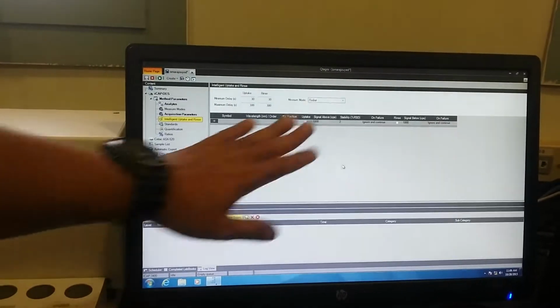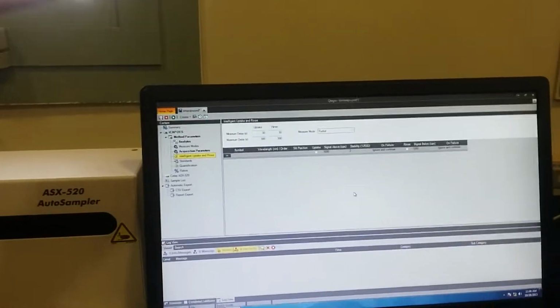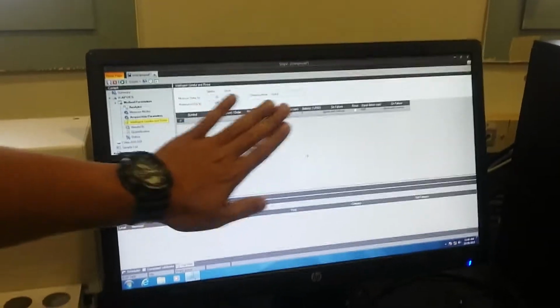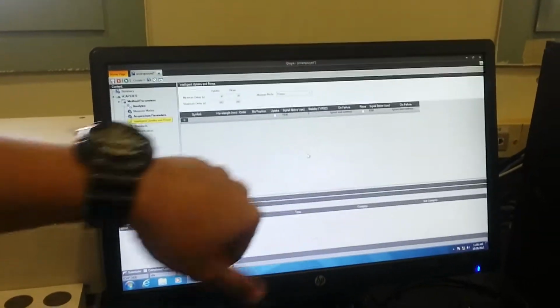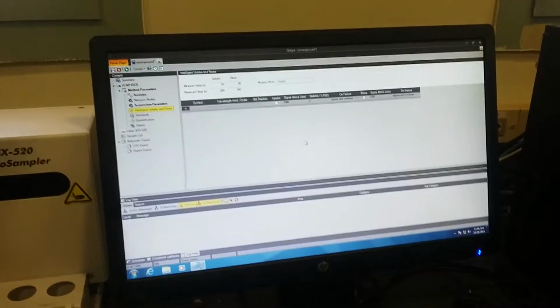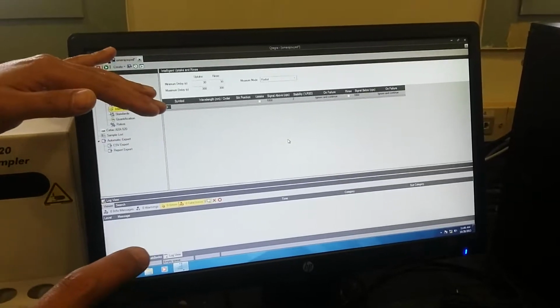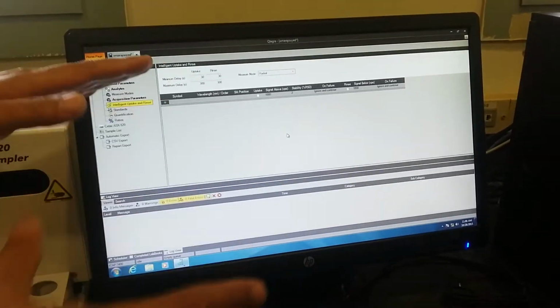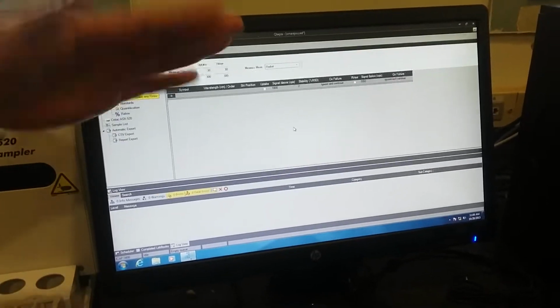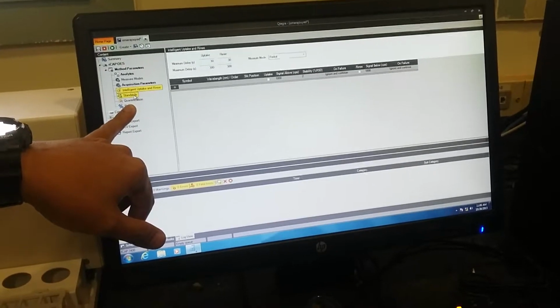But usually we don't need it. This is only when you are doing R&D on the sample. It can help, but for now I would suggest don't touch it. Later you will find out the purpose. I just want you to first do the basic thing, and then we will move forward in time. So let's go to standards.